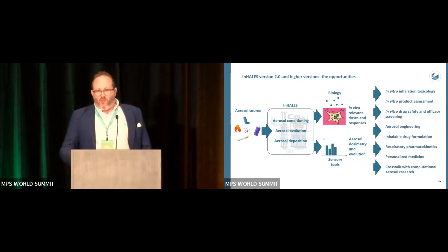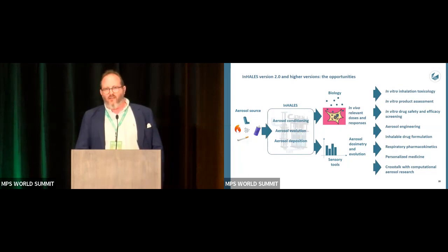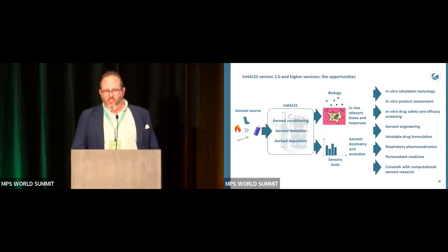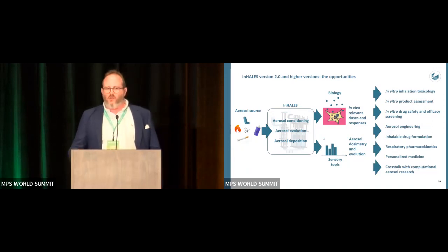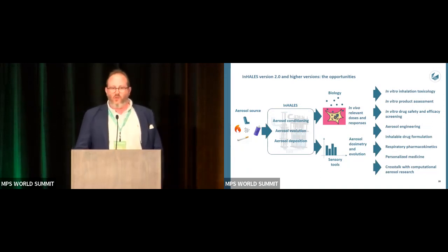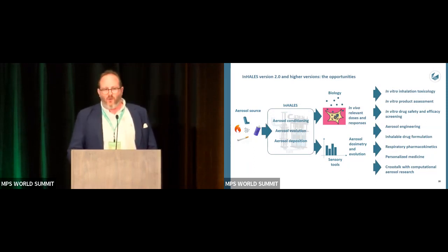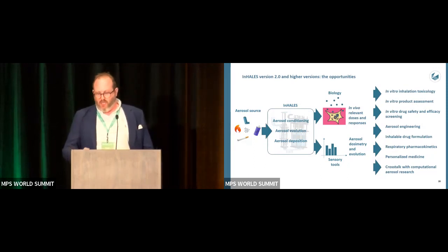So the opportunities we see are great, actually. You can see a lot of aerosol sources: sprays, environmental sources, fires, medical inhalers, inhaled drugs, but also smoke, for example. These aerosol conditions and the evolution of the inhalers can then be translated to the biology, and we can work with different aerosol dosimetry and evolution tools to expose the biology to different patterns of aerosols. And you can see where it can be applied.